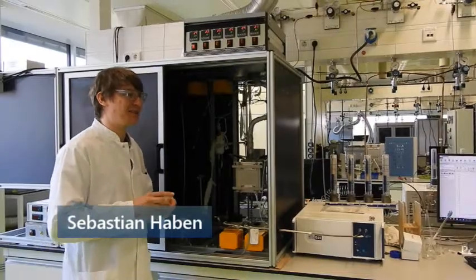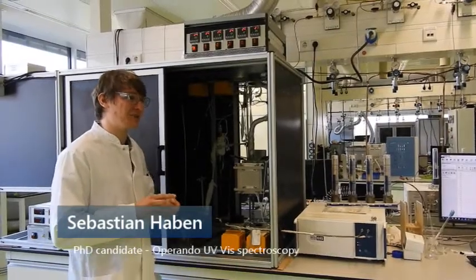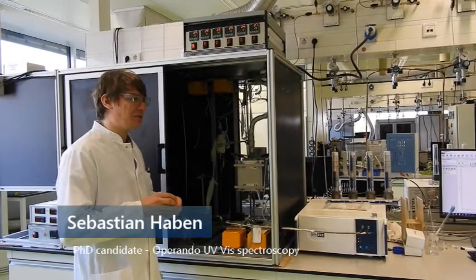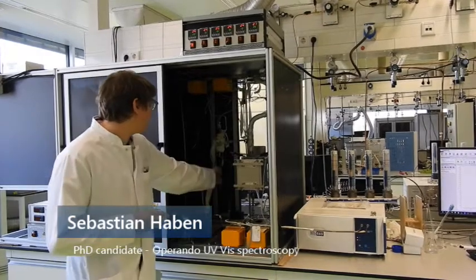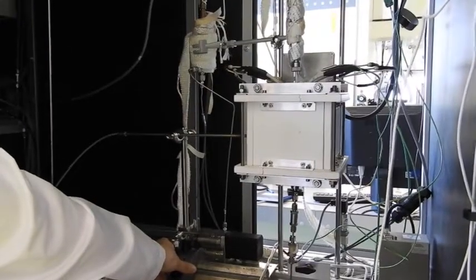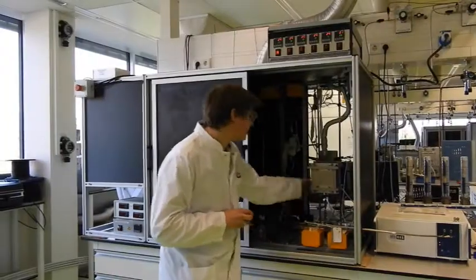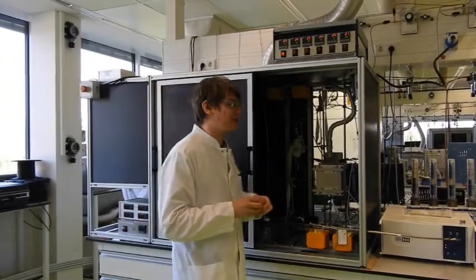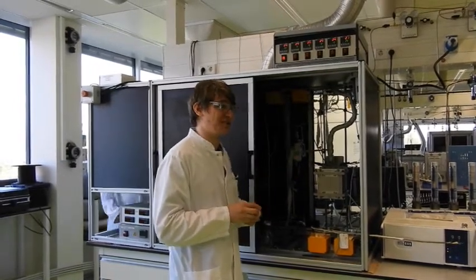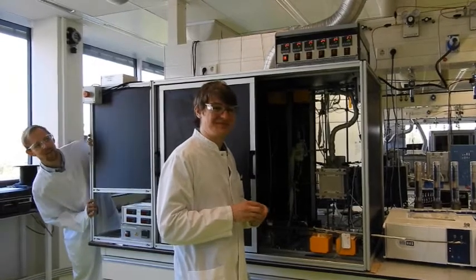We can even watch it come to life by using operando spectroscopy. What is operando spectroscopy? Well, with operando spectroscopy, we have a little camera right here that we can insert into our reactor. We look with the special camera and then watch the products come out. And I use it, for example, for studying coke. And the nice thing is, we can even do it at high temperature with the setup. Did I hear you say high temperatures?